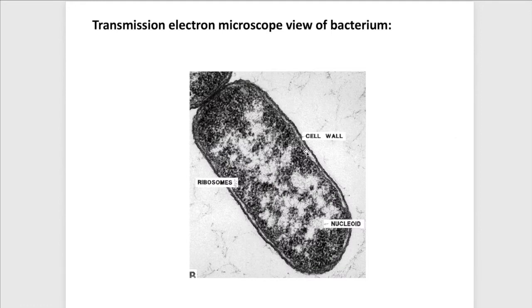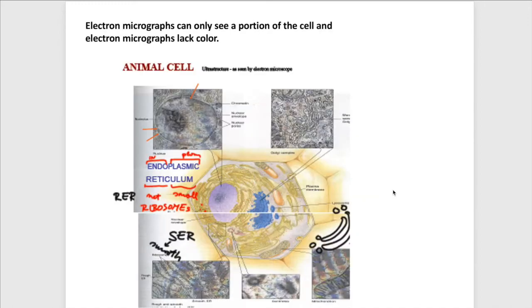I can see inside the bacterium. I can see there's a cell wall, there's a cell membrane. I can see these particles in there. I can see lots of details that I can't see with the other two types of microscopes that we've looked at. And now we're on the road to understanding what's going on inside of the cell, what is enabling this particular cell type to live and survive in its environment.